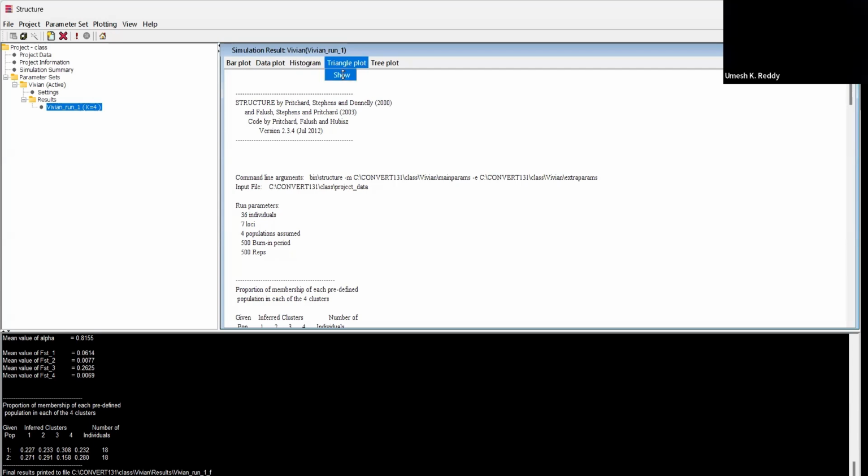Okay, and then you can also see it here. These 2 are the genetically more related populations. Population 2 individuals are green, population 1 individuals are red. You can see how they are clustered in this. Okay, if you want, you can make a tree plot also. So you can say lineages 1, 4, 2 are grouped together, whereas the third lineage is showing more diverse. So this kind of analysis can be done using population structure.